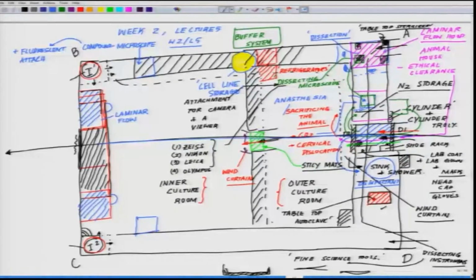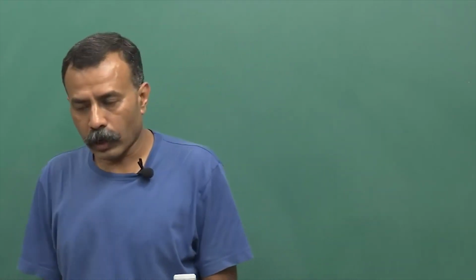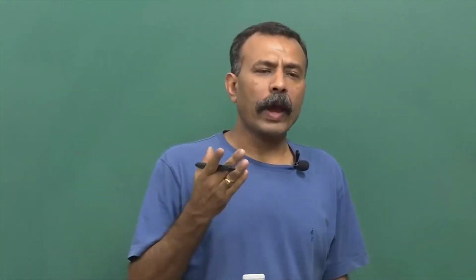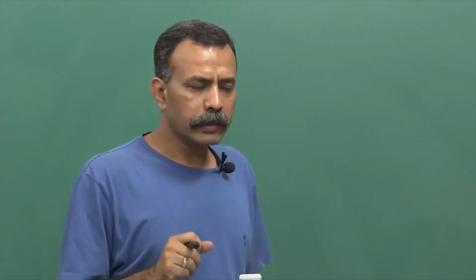That I will leave it to your requirements and to your wisdom, because that decision only you can take, whether you want a fluorescent attachment or not. But what I will recommend here is something else: where you are plating the cells. That's important. Why is that important?